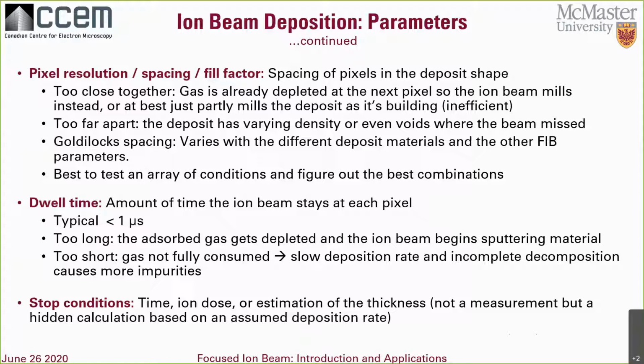Okay. How do you make sure the TEM lamella thickness is reached, say, for example, 20 nanometers, because it's so difficult to image? Yeah, so this is sort of by experience, because at that point the FIB image isn't going to give you anything useful. And even if you tilted back to 0 and tried to measure it with SEM, you're not going to measure very well at that scale.